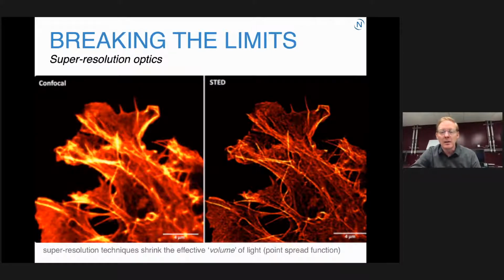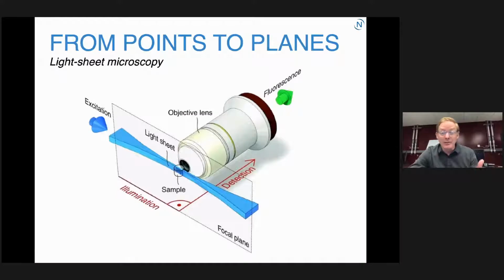with light. And then most recently, which is really fun, is that people have reconsidered how these microscopes work, right? All of those measurements you just saw were done by scanning a laser, a single point, and measuring things point by point by point and reconstructing an image. That gives you very high resolution, but it actually slows things down quite a bit, such that processes and dynamics, things that are changing, become a bit tricky to measure.